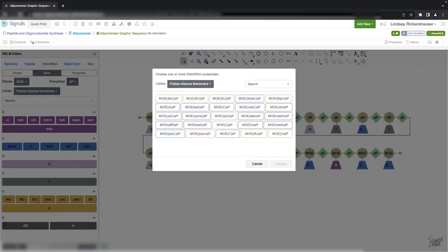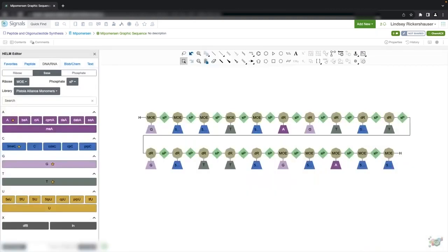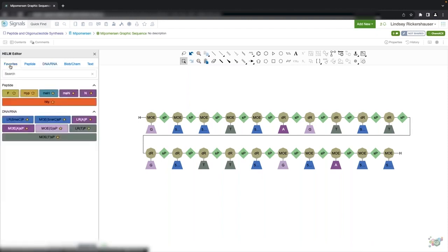And so I can come in here, I can choose that 5-methylcytidine, my thymine, and an adenine, and I can go ahead and select it. What I see immediately is I have little stars. Those are my favorites. I'll see those indicated when I'm looking in this oligonucleotide tab, but I can also flip over to my favorites tab, and now I have those listed for myself, the thiophosphates, that full triplet, so I can quickly and easily get to them.